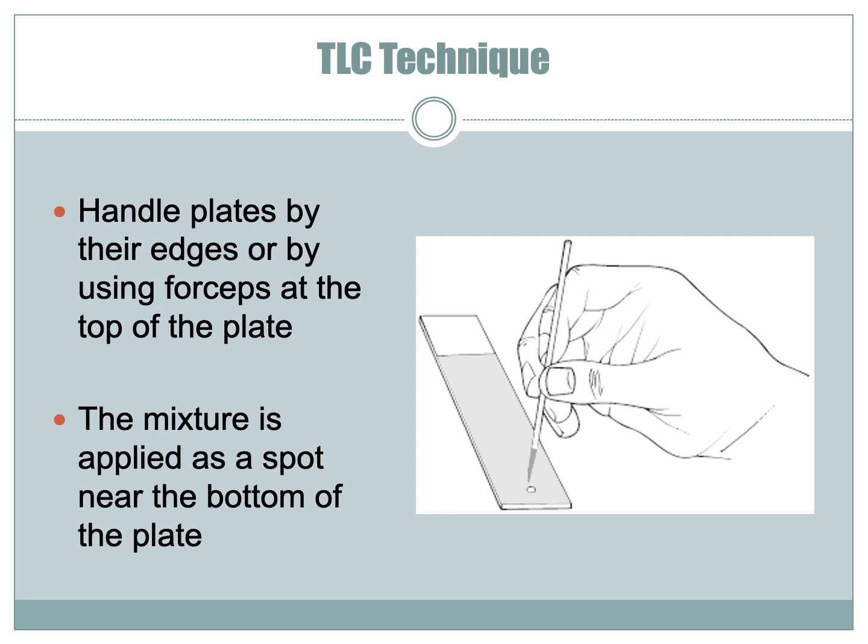What we do is we take our plate and we make a solution with our mixture or our compound of interest, and we take a capillary that looks like a melting point capillary, just a really thin glass tube. We draw a little bit of solution into our thin glass tube, and then we make a very tiny spot onto our plate by pushing the solution onto the plate until it makes a little spot. And then once the solvent dries, once the solvent evaporates, what's left on the plate in that spot is your mixture of however many compounds there are.